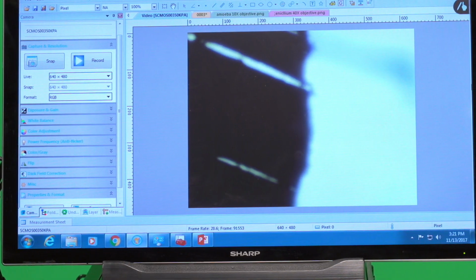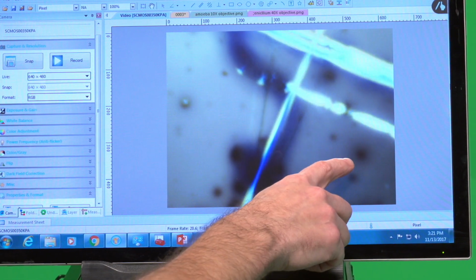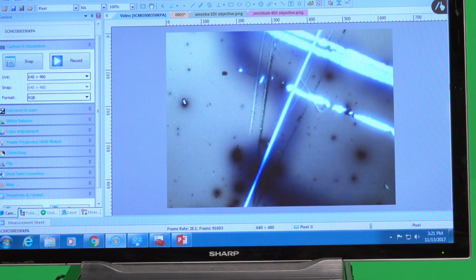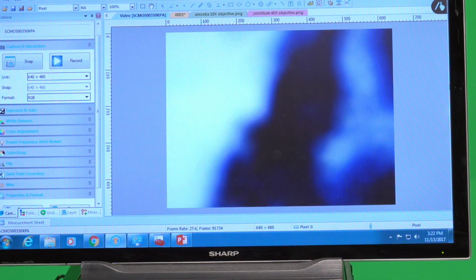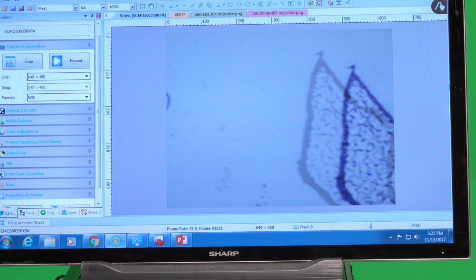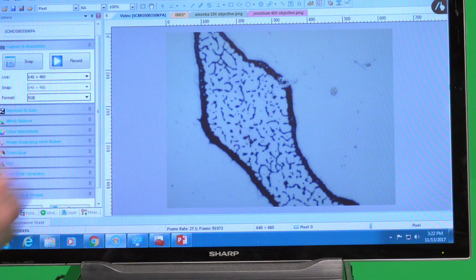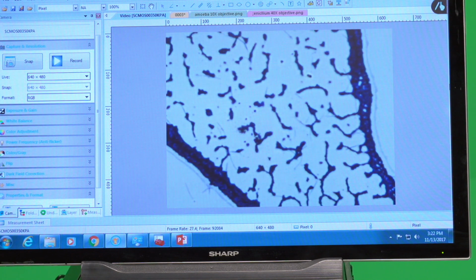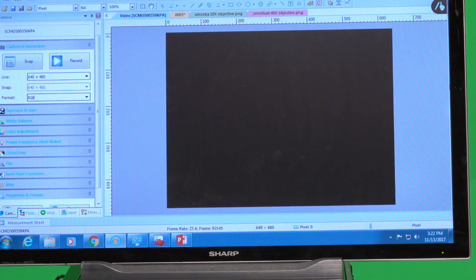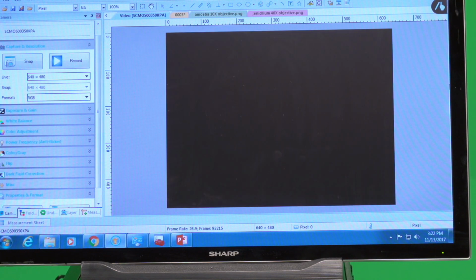And so when we focus in on it, we can also see that there are blotches of dye. Okay, so don't get tricked into that. That whole thing is your Sharpie. Investigate your Sharpie as much as you want, but don't submit pictures of Sharpie to the class. Okay, so this right here, I think we're gonna have something good here. So I'm gonna go from 4x to 10x, get it in focus, from 10x to 40x, get it in focus, and then I'm going to go to 100x.